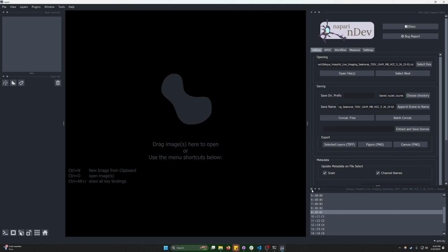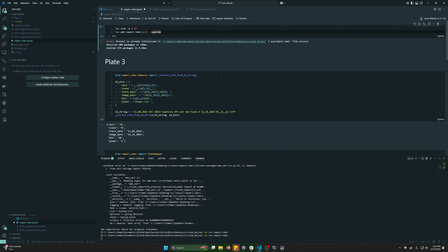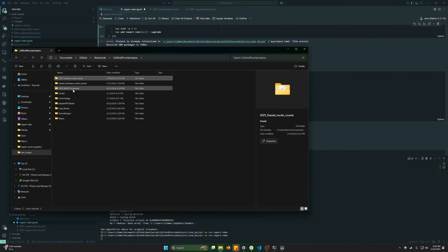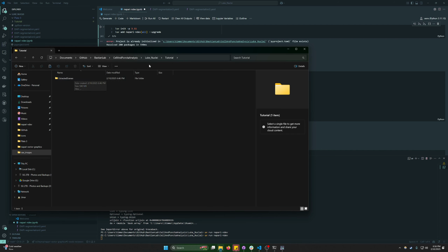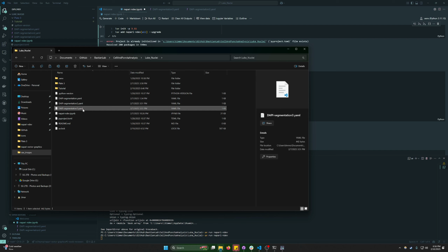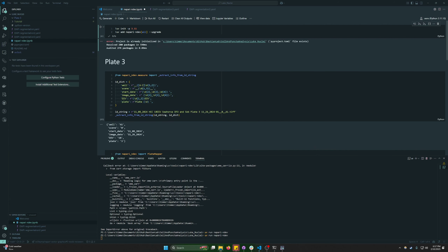So what do we need in order to do this project? Well, in here already, as I mentioned in this tutorial for Luke nuclei, we just have our extracted scenes. And in Luke nuclei, I've made previously, and this is the advantage, a shareable file, this .yaml file, and we're going to take this .yaml file and stick it in here. We don't have to. We could access it from there, but just to put it all in the same spot to say this is what we used.